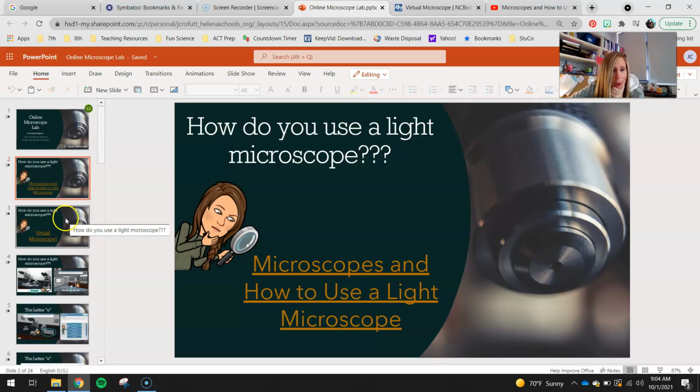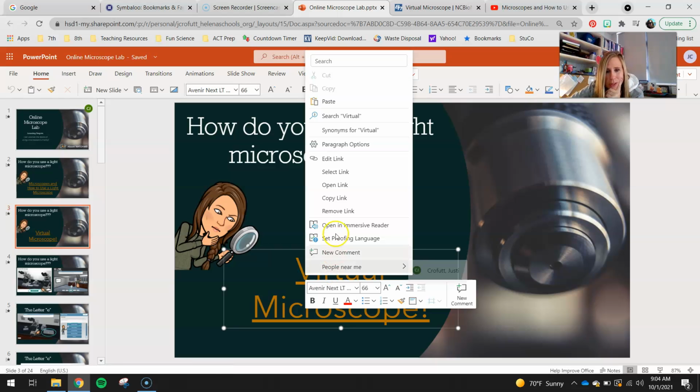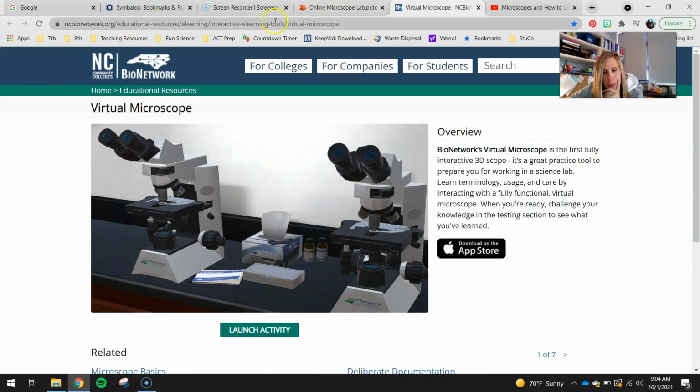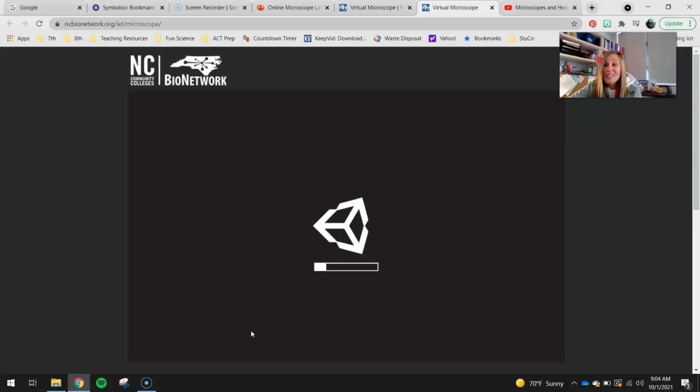Okay. All right, moving on to slide 3, here is your link for the virtual microscope. You'll want to go ahead and right-click and open that link up, and it's going to take you into a page that looks like this. We're going to go ahead and launch our activity. There is a series of slides that we're going to be looking at, though it might take a second to load. But just to get the basics down, we're going to look at the letter E.